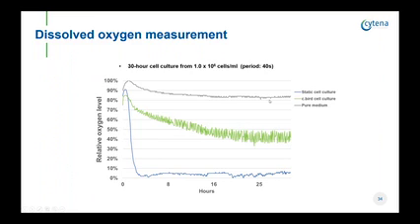In gray, you can actually see the oxygen level of a control experiment. This was a well plate with pure medium, and obviously here the oxygen level stays constant.